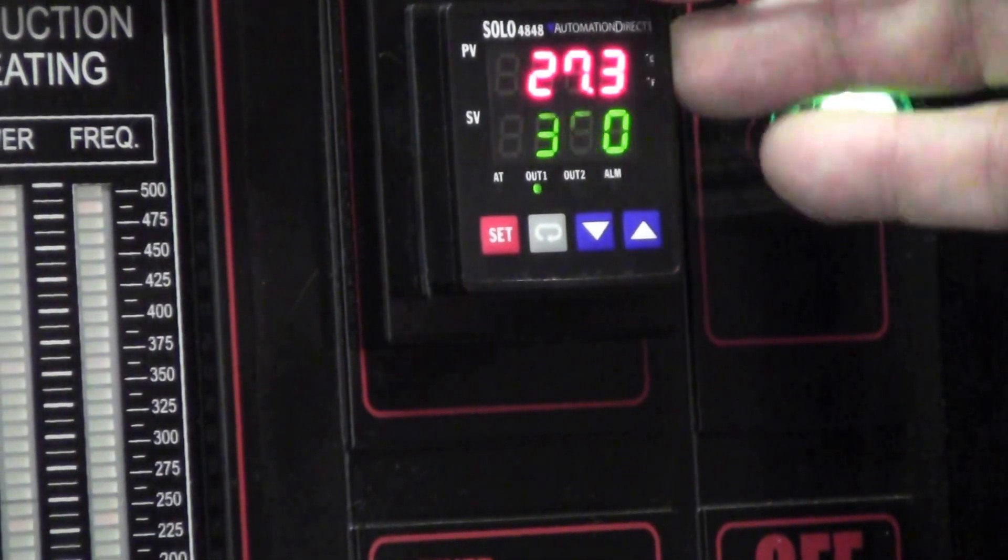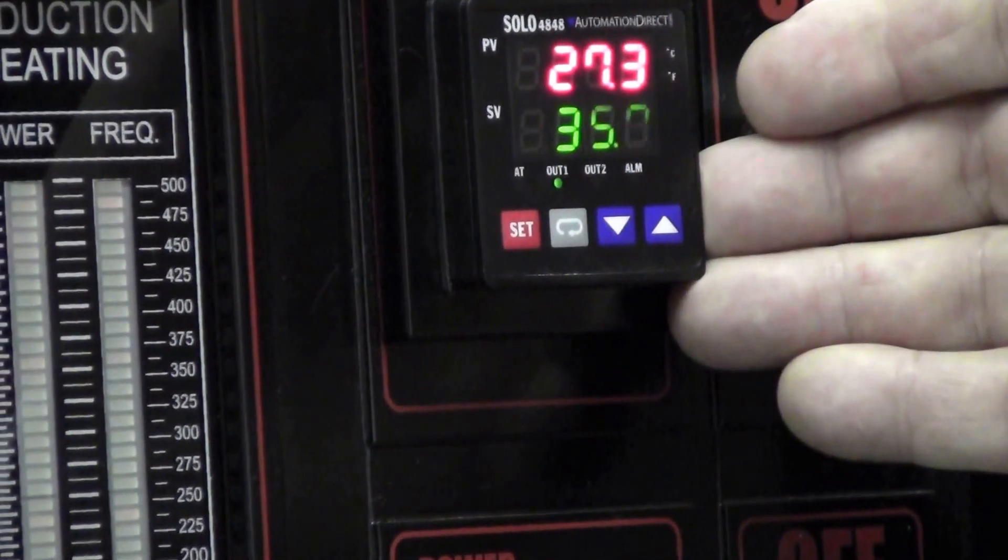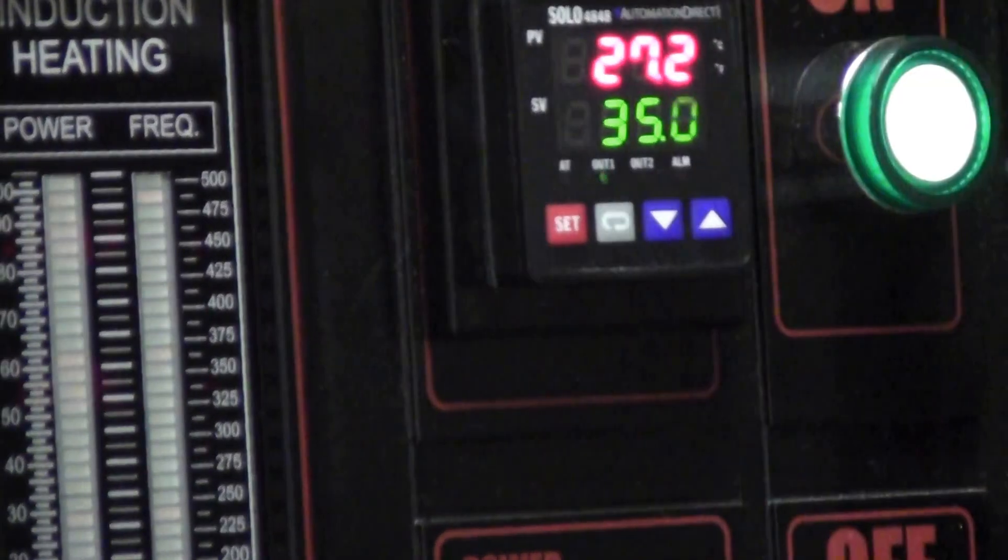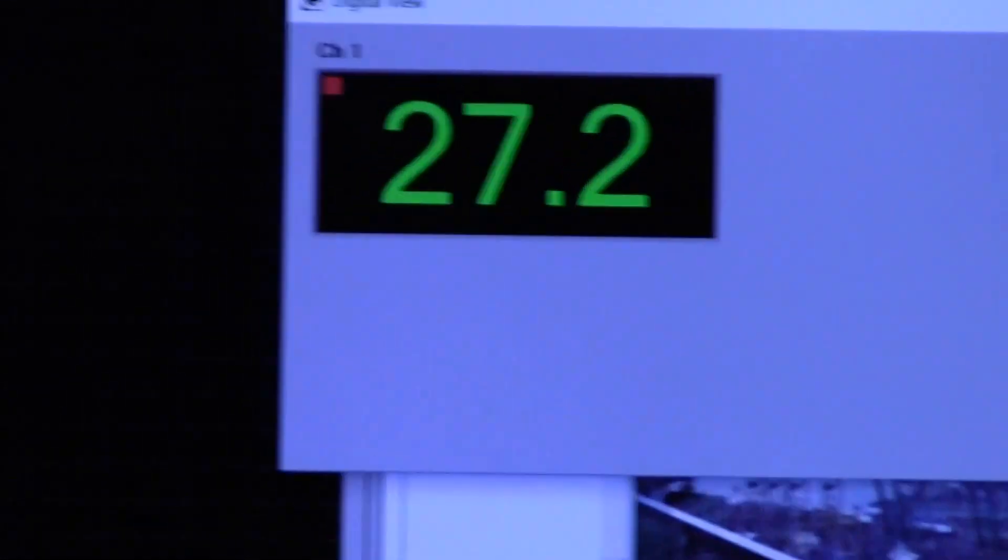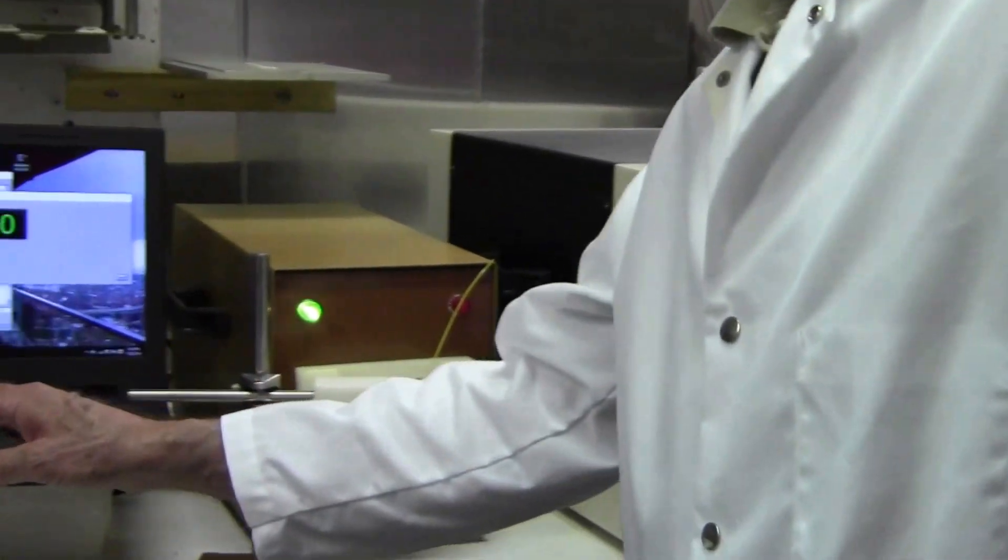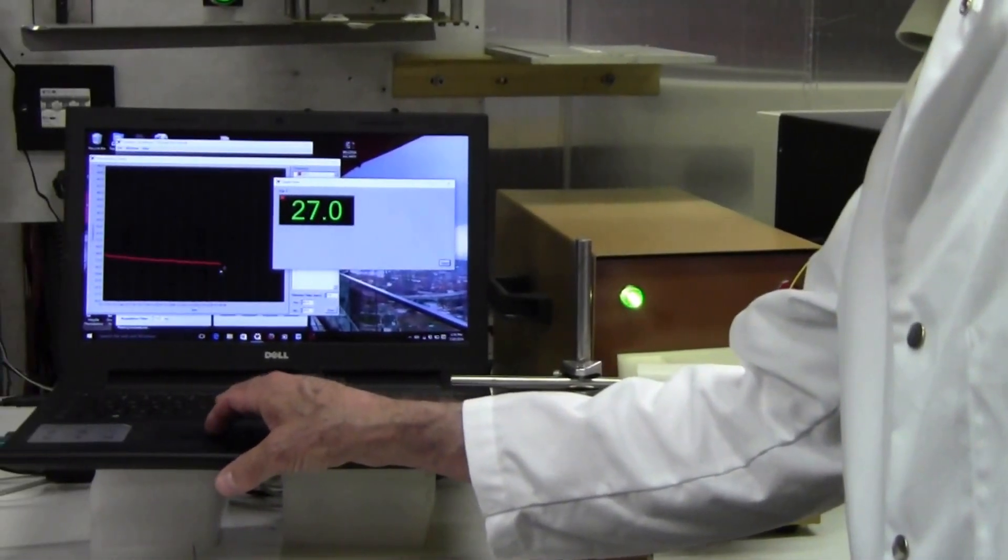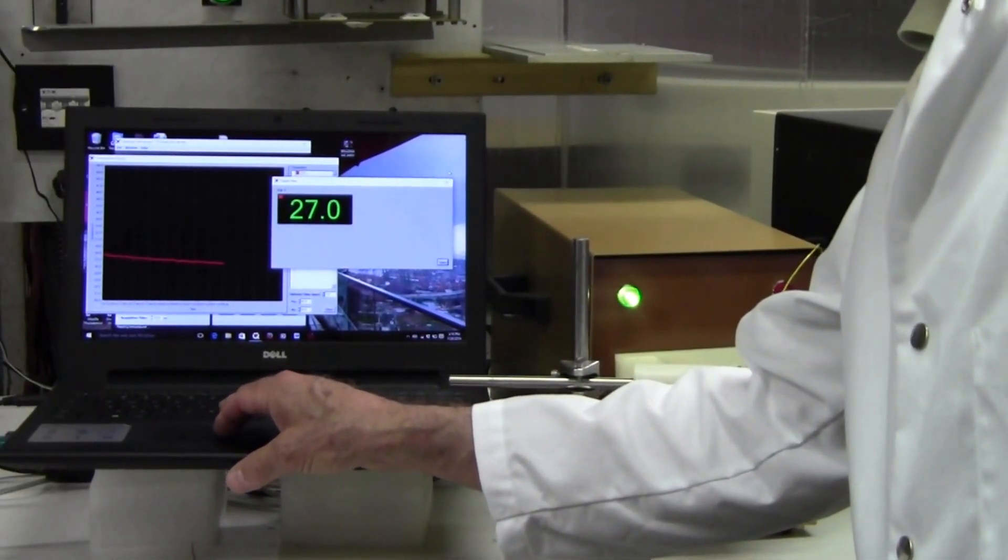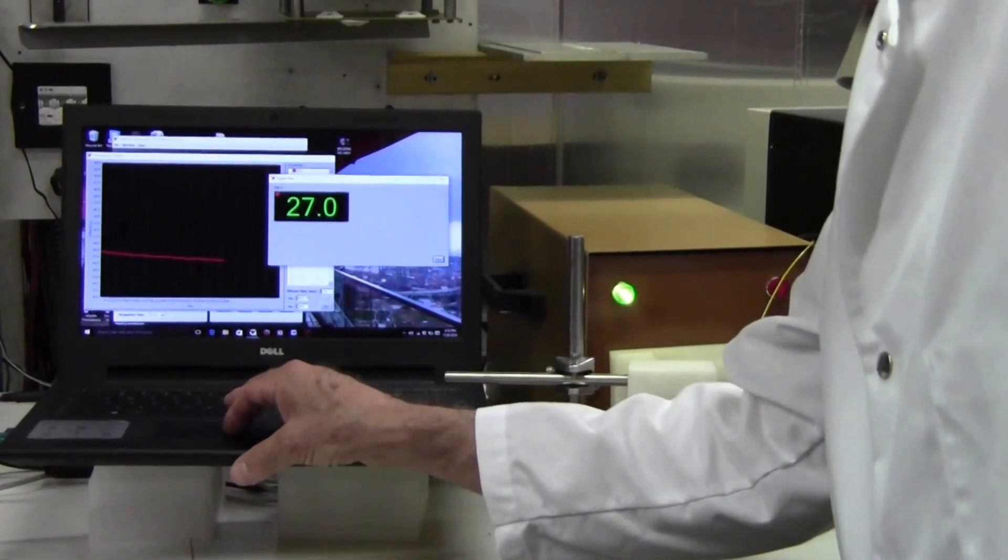Okay, so right now we are at 27.3, and that's the same value shown on the laptop computer. So we'll perform the same heating trial, but you'll see that the temperature controller will prevent it from going above 35 degrees Celsius.